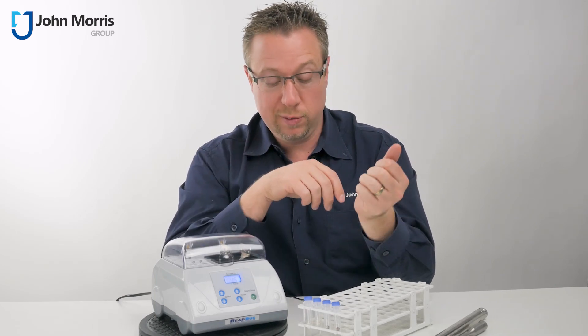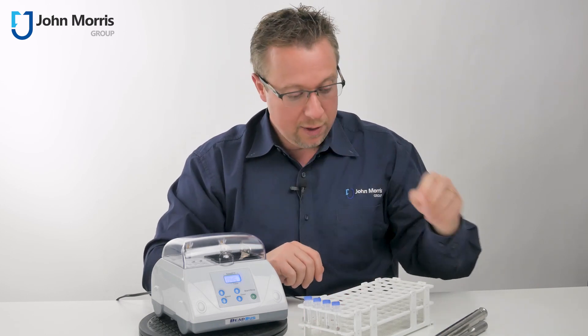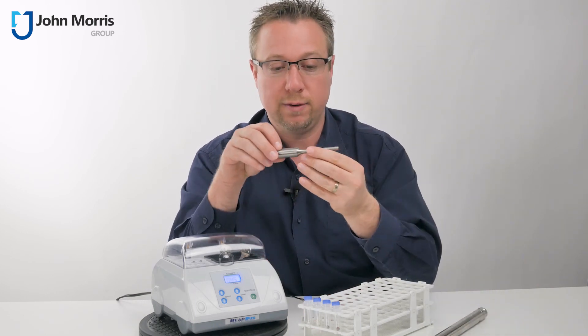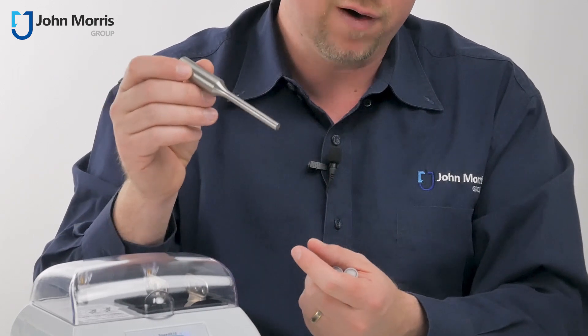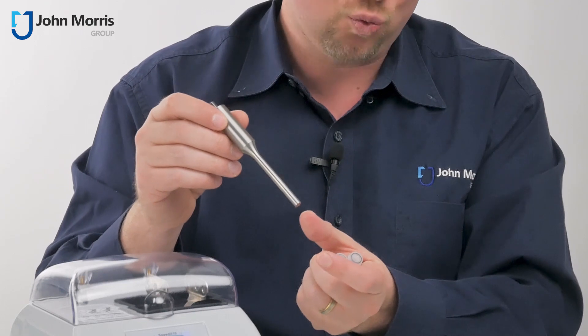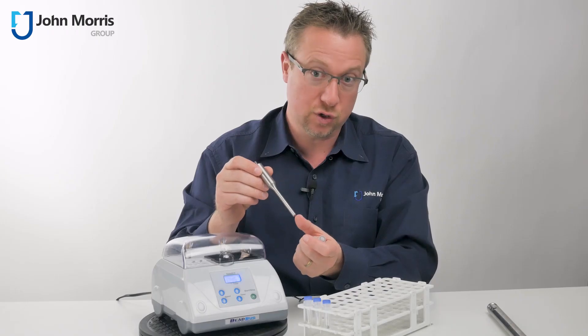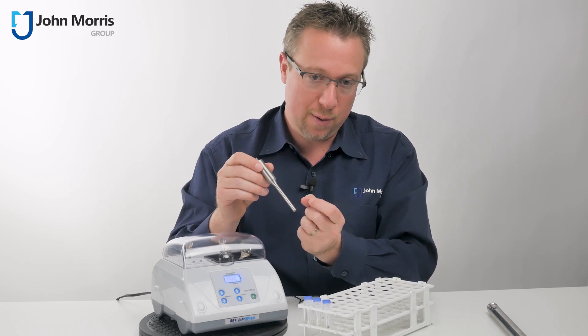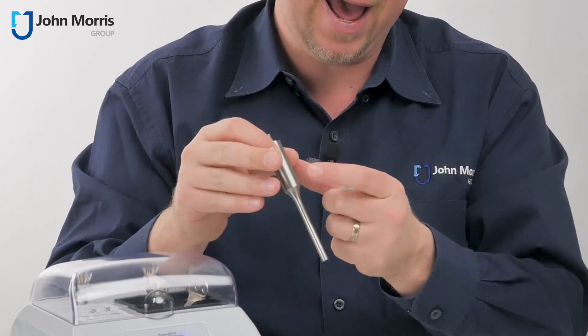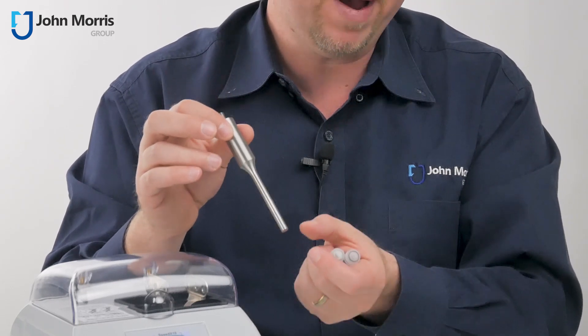These samples would usually be quite difficult to actually homogenize and to bring into suspension, and there are a range of different ways that you could do that. For instance a sonicator — this is a probe off a sonicator — and the advantage here is that it will break open cells really, really effectively. You get 20,000 cycles per second of sonic waves that literally come in and expand and collapse the liquid underneath it, causing cavitation which will literally smash open cells.